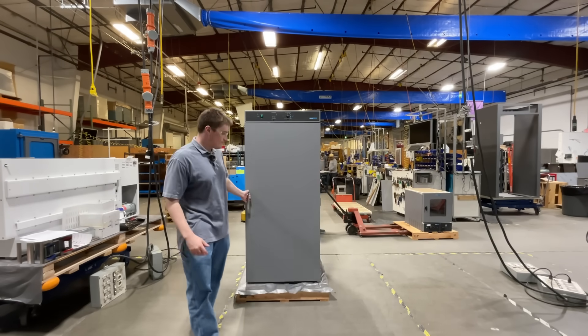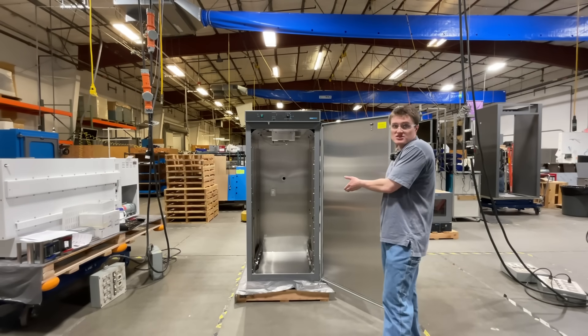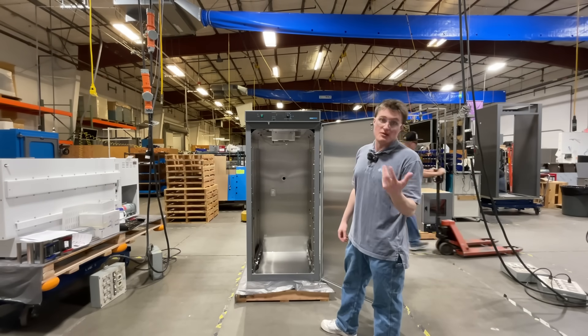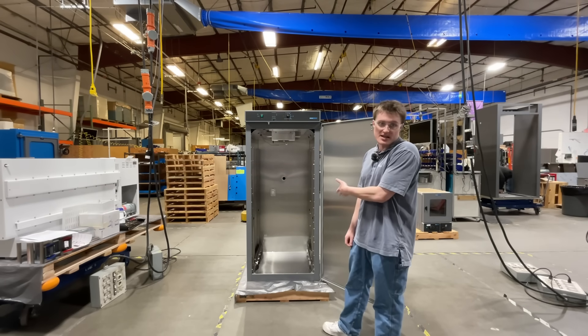Let's take a look inside the unit. The 20 cubic foot capacity, along with 5 shelves that come with the unit, provide ample space for any samples or flasks that you may need to fit inside.